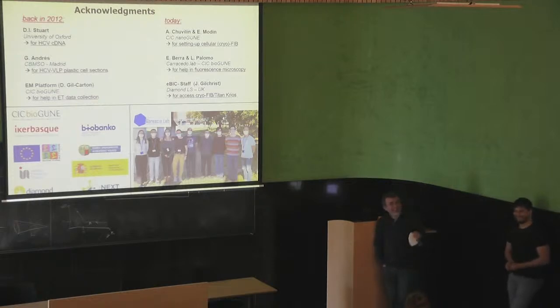I would better answer that he's very skeptical. We have had quite a bit of discussion. There is very little in the literature done on using xenon plasma on cells. But there is one nice paper, I didn't write down the reference, in which they comment about the possibility of using xenon plasma on cells, because this would be the next step on all the advantages in material science. I have to say that the CryoFIB for cellular comes from material science. That is very important. So I was skeptical, but I was convinced by Andrei, because material science is the expert, that the transition to cellular samples would be smooth.